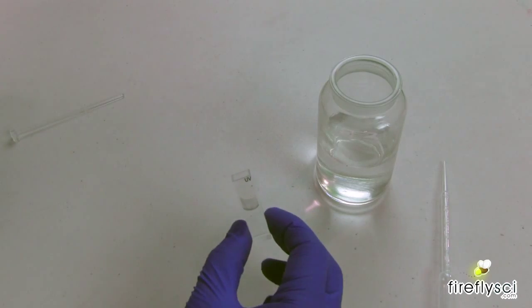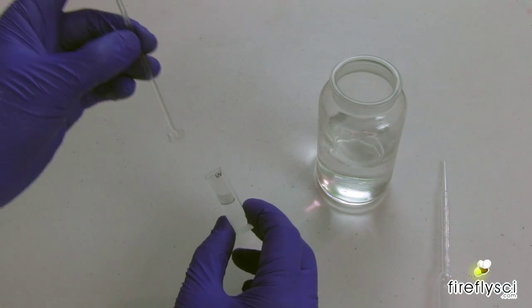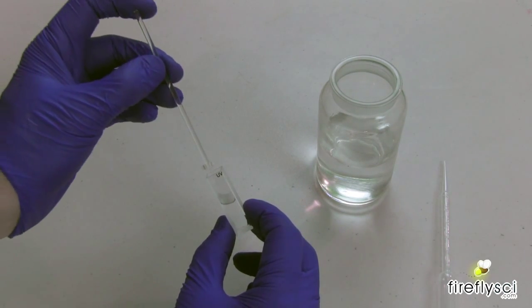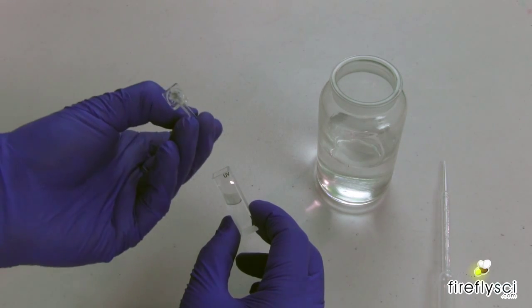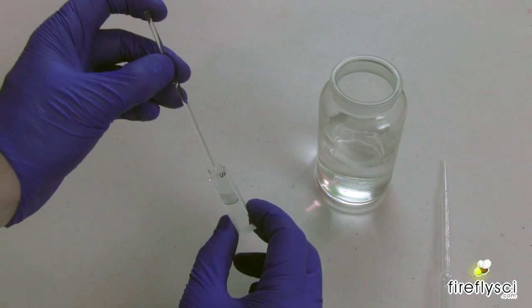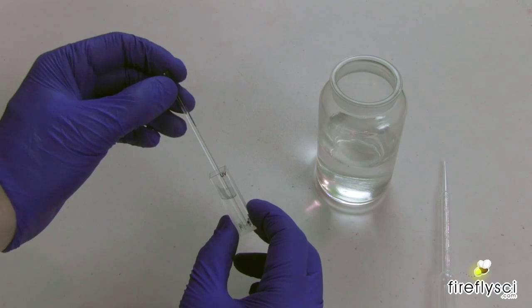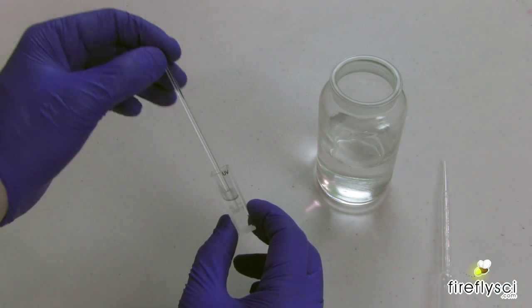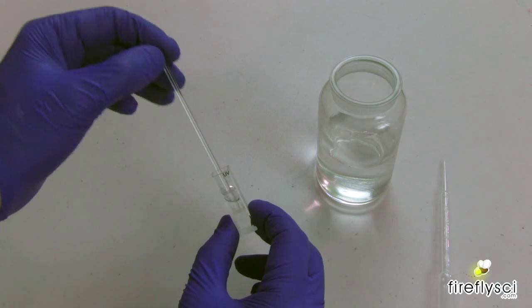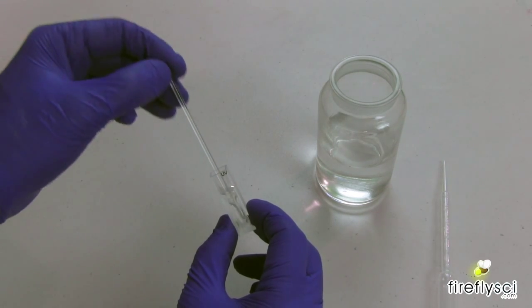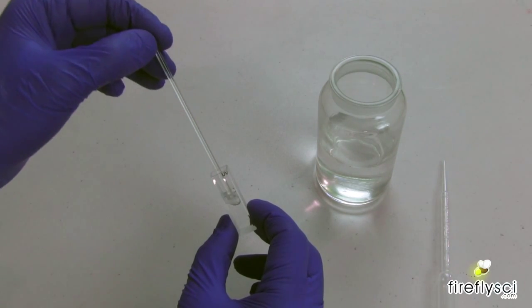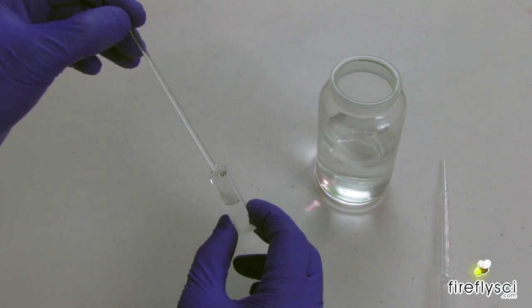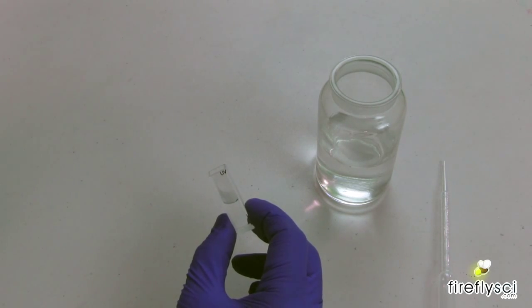Okay the accessory I actually wanted to show everyone is the mixer here. So this is just like a little plunger, it has little holes in it, so you could insert it down into the cell without splashing sample all over, and you just pump it up and down. And just make sure that your sample is nice and mixed. Let's take it out, and you're done.